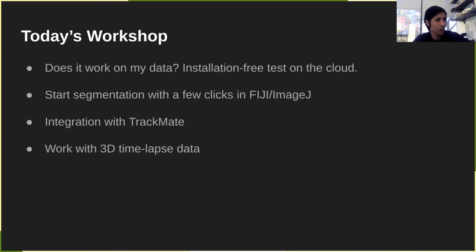The first thing a lot of people ask when trying to use a deep learning model is, how do I know if it works on my data? So we're going to show you some installation-free tests just using a cloud server.